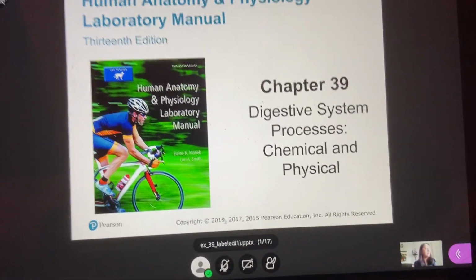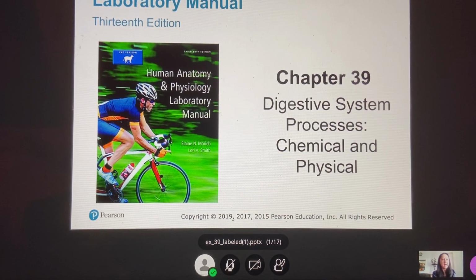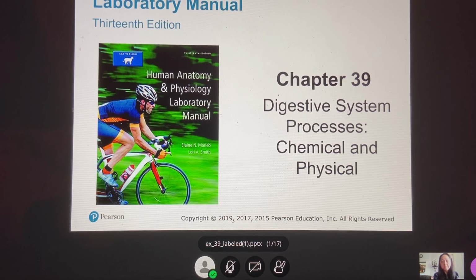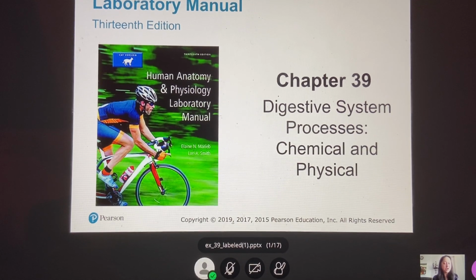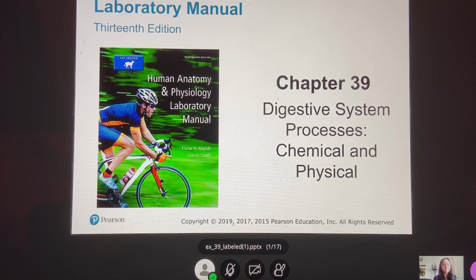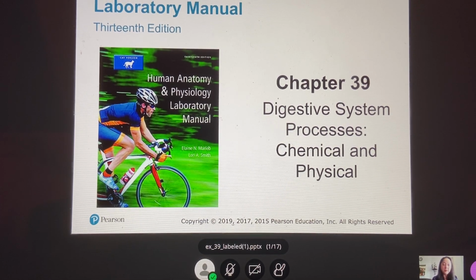Actually in the lab, in the actual experiment, I always tell my students that I don't expect them to get the accurate result, especially if it's the first time to do experiments and all that. Contamination is the number one culprit there, so you will not be able to get the ideal result. And also, aside from contamination, is the preparation of those enzymes.